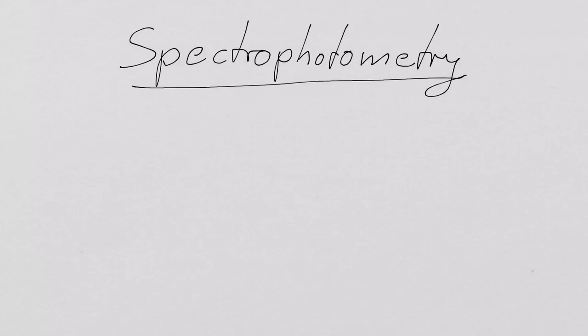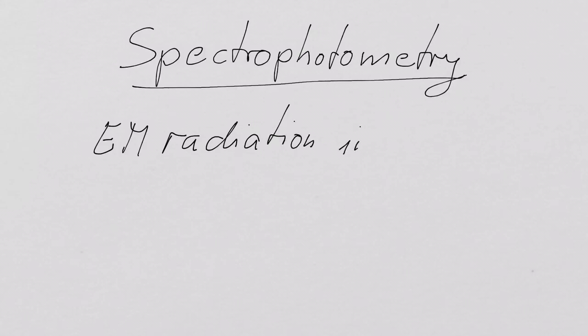And we'll come back to that in a minute, why it interacts. So for the time being, let's just simply say any kind of electromagnetic radiation interacts with matter.